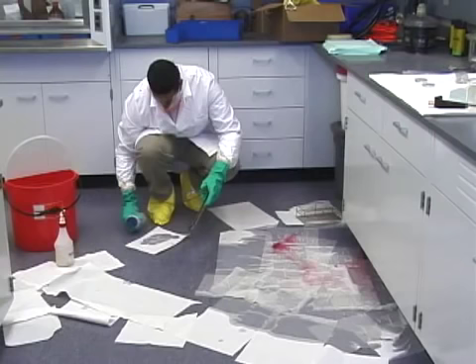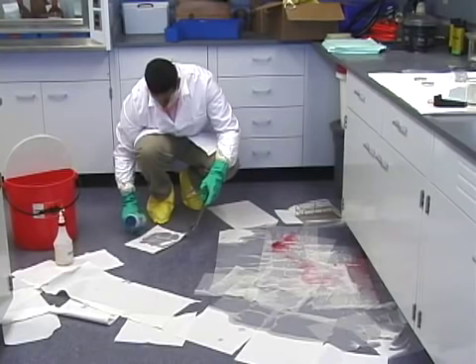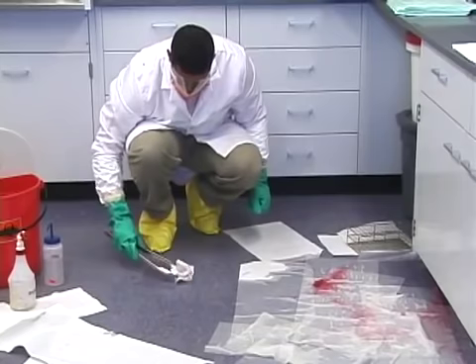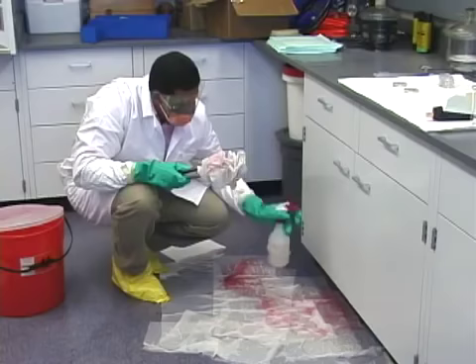While waiting for the disinfectant to do its job, soak some paper towels with disinfectant and clean any visible contamination found around the spill. Always use tongs in case sharps are encountered.